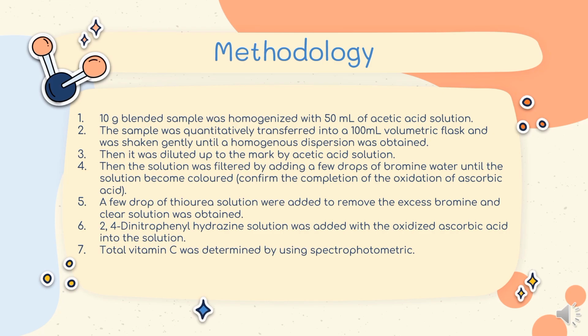2,4-dinitrophenylhydrazine solution was added with the oxidized ascorbic acid into the solution. And lastly, total vitamin C was determined by using spectrophotometry.